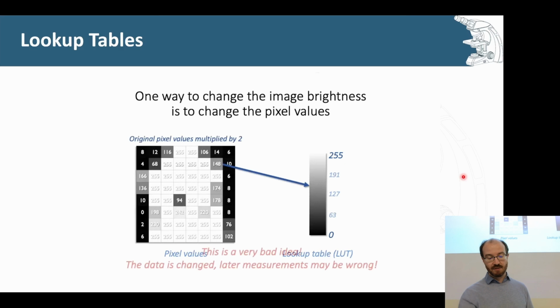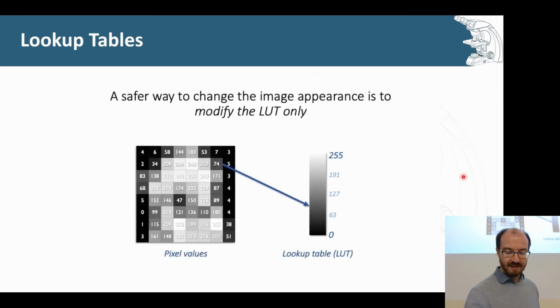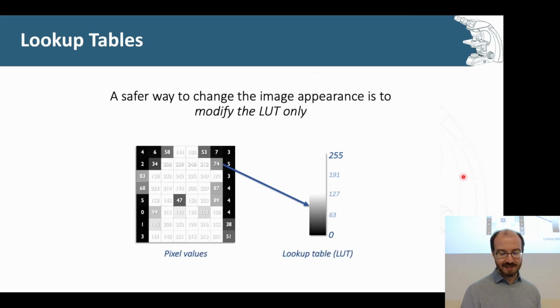Something else I can also do is invert the lookup table, in a sense. You can make it so that the top part is entirely white, for example, and then you saturate your image. You can make it so that high values are shown as a dark color, or the inverse. So you play around with this lookup table however it helps you to visualize or understand, as long as you don't end up saturating your actual pixels. As long as the intensities inside don't end up clipping and saturating, it's fine.